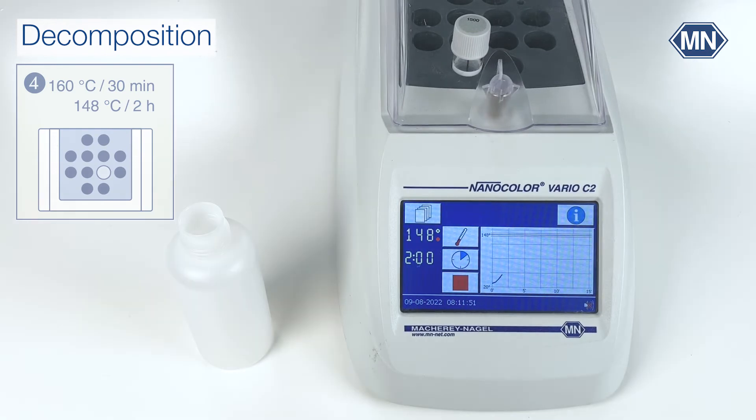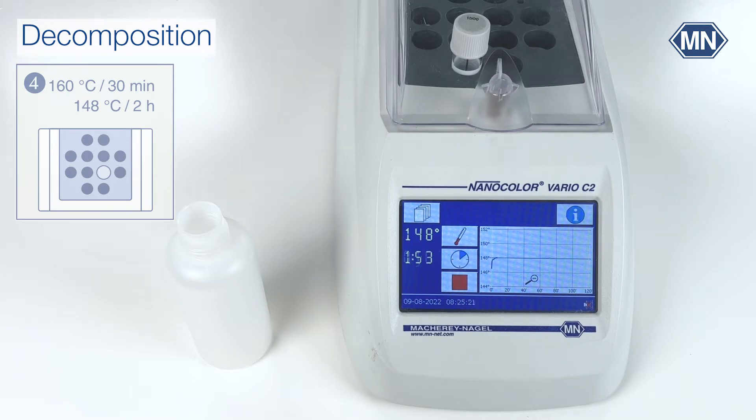You can also use the quick COD method at 160 degrees Celsius for 30 minutes. Please make sure that this method is sufficient for your sample by comparing the result to a normal decomposition at 148 degrees Celsius for 2 hours.